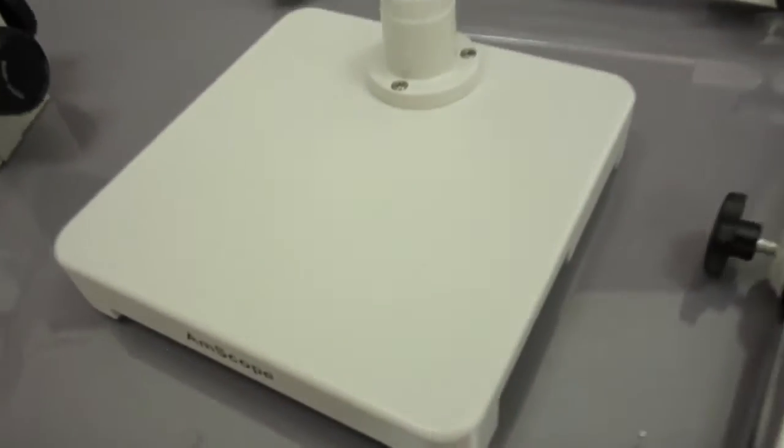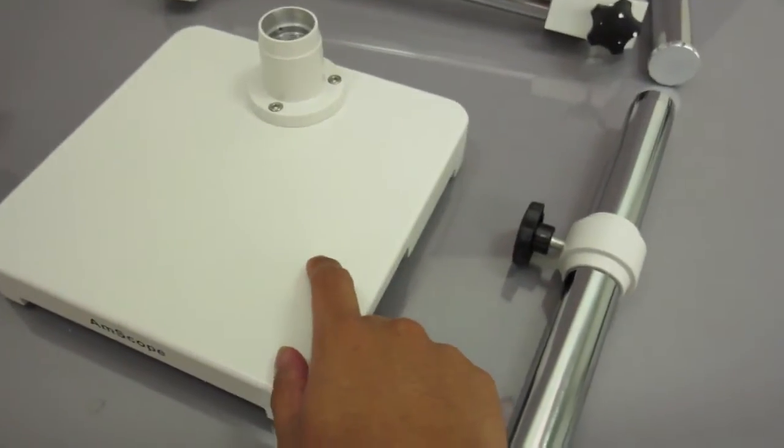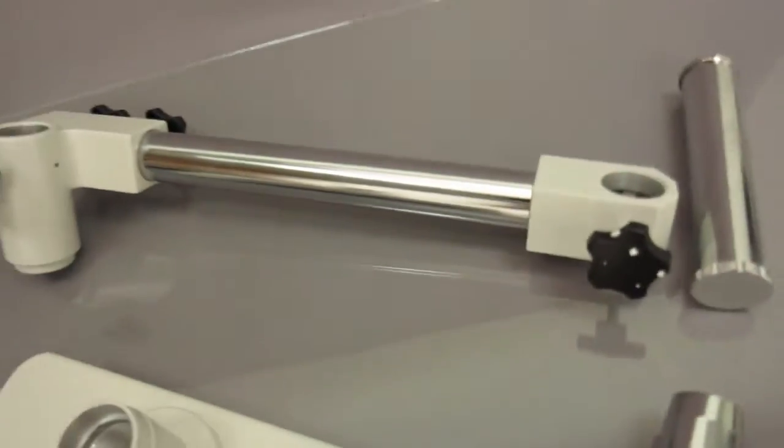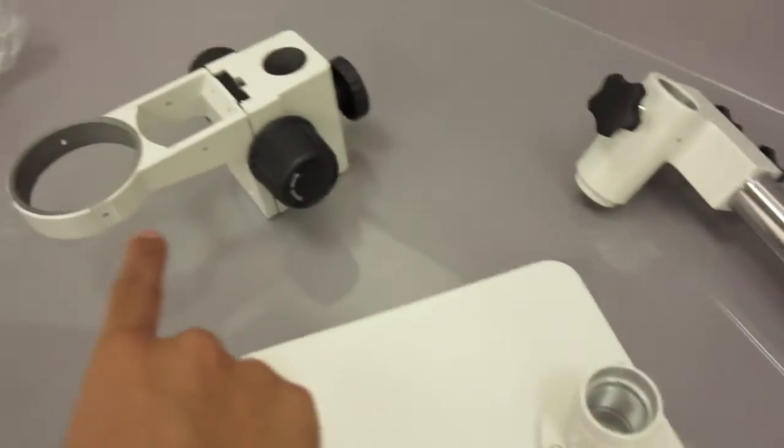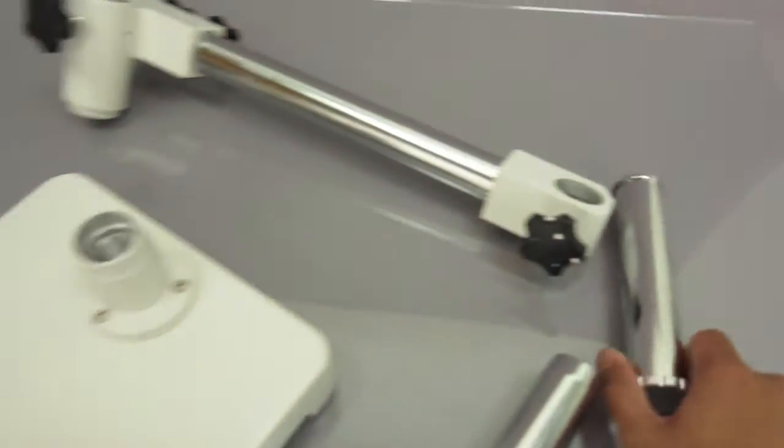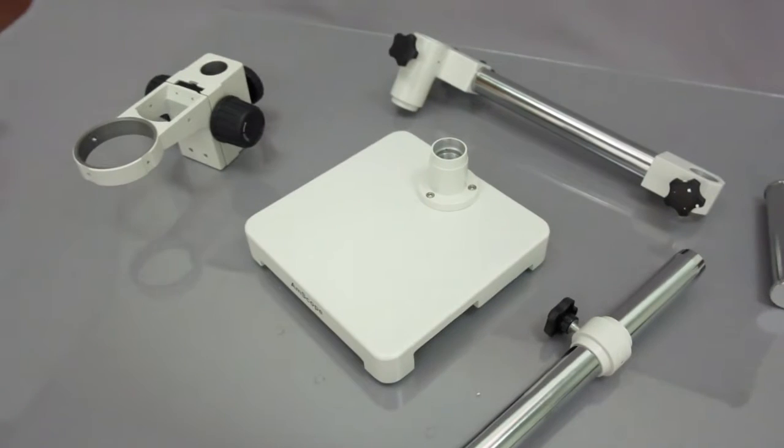And then you have the stand. This is the pole that goes into the stand right there. And this is going to be the arm that holds the focusing rack. And this would be placed into here. So let's go ahead and get this thing assembled.